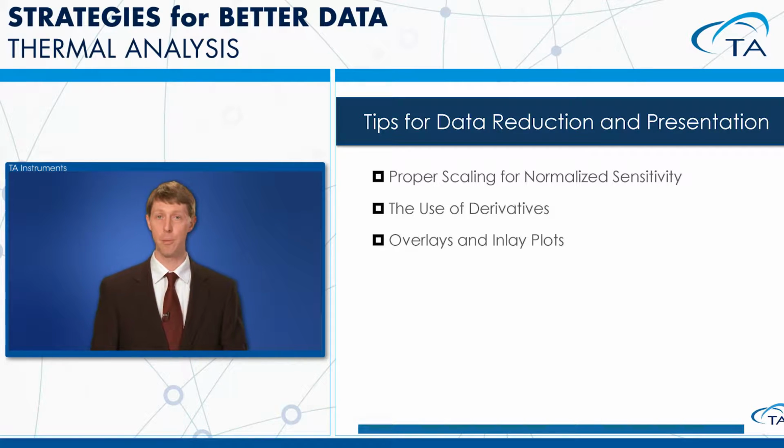We'll look at some proper scaling for normalized sensitivity. We'll also take a look at some derivatives and appropriate use of derivatives. And we'll also take a look at some overlays and inlay plots.